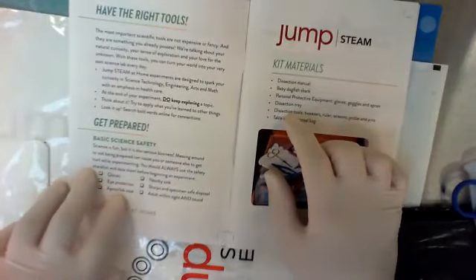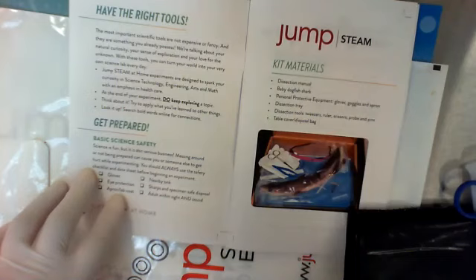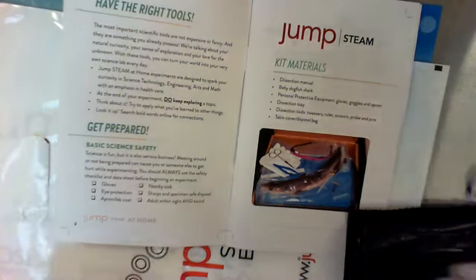So, eye protection, apron, lab coat. I have my lab coat on. You were given an apron. When you open up the apron, it has a set of straps to go around your neck. It has a set to go around your waist. So just make sure you put it on. It's to keep this stuff off your clothes. Remember, formalin, formaldehyde's in the fabrics around you. If it gets on it, it likes to stay on it, so you might stain your clothes and it might permanently smell like fishiness. So just keep that off of you.